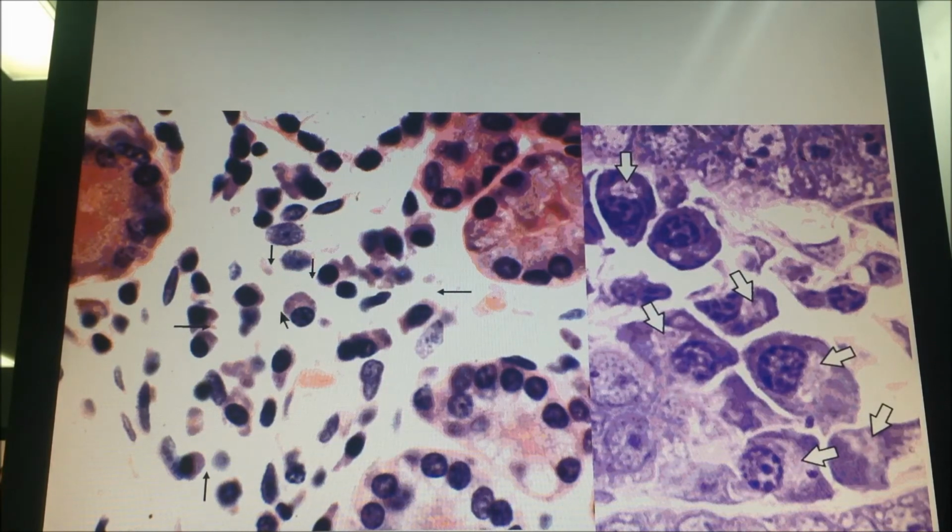Let's come here, another cluster of cells. You see this cell, this is the plasma cell, and this section is highly characteristic of the plasma cell. The plasma cell is one of the most easily identified cells in the body. Its characteristic features: number one, the nucleus is rounded and eccentric, on the periphery. In the nucleus you see the chromatin arranged like a wall clock, a clock face appearance.